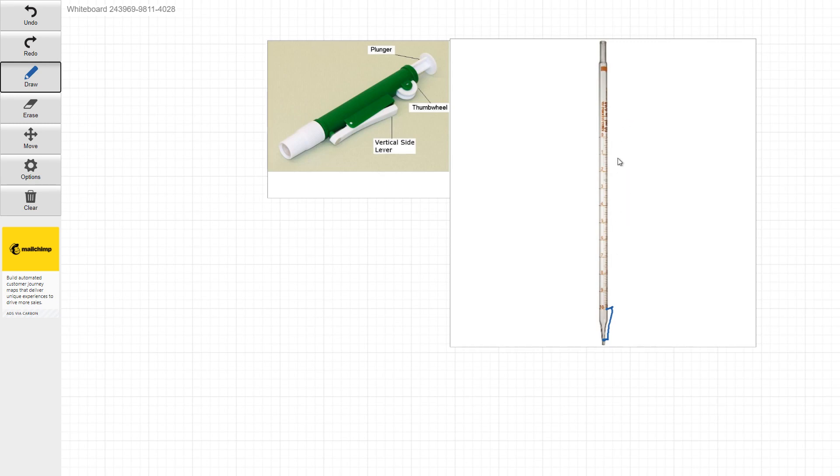Now, how would you actually dispense it? You'd be using this pipetter here. So this tip goes into the pipetter right down here. And you guys are going to see it's pretty simple. So there's the thumb wheel here. There's this vertical lever here. And then there's the plunger.